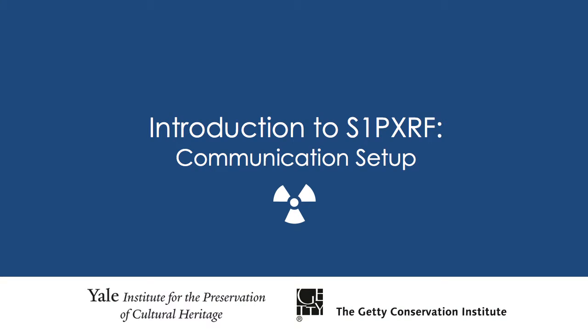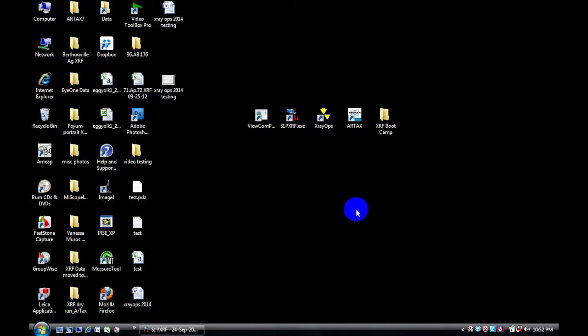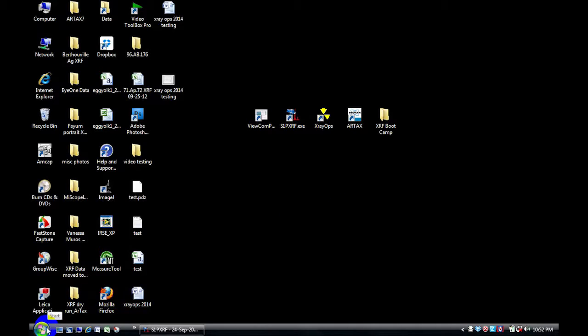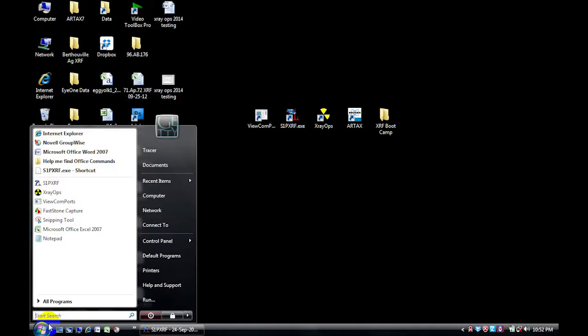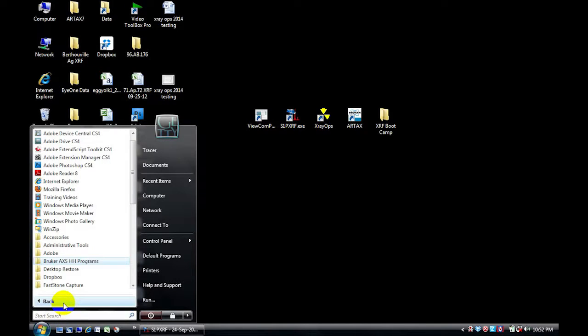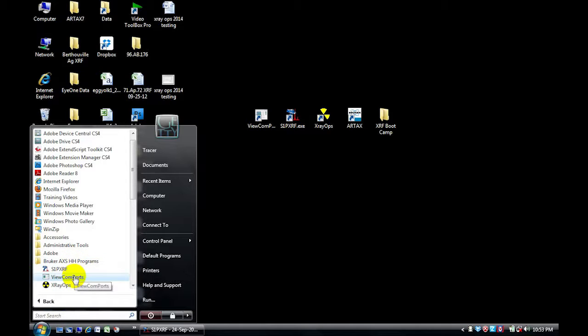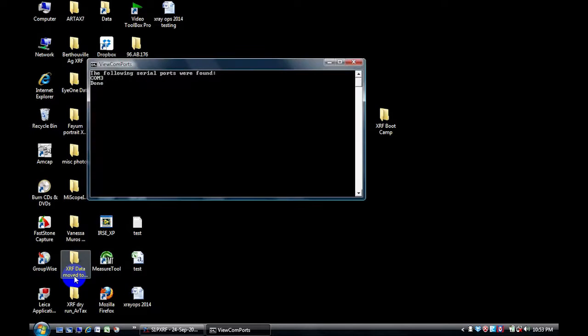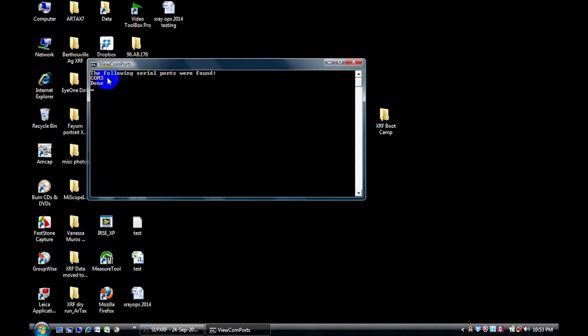Before we begin, we need to make the communication connection between the instrument and the computer. To do this we need to know the COM port number that the USB is plugged into. There are two ways to do this. The first way is to go to the start menu and click on all programs, go to the Brooker AXSHH programs folder, click on the view COM ports icon and that will tell you your COM port number.